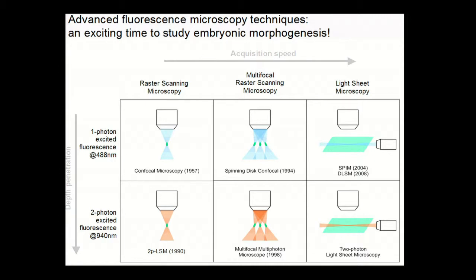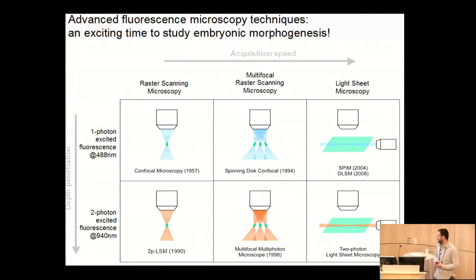The thing is that we can go deeper, faster, with lower phototoxicity using adapted microscopy techniques, and we generate a huge amount of multidimensional data. The challenge is to visualize this data, to process this data, and to visualize the features we are computing on this data. Working on this presentation, I realized that visualization is an issue for almost every aspect of my work, from the time we acquire the data to the time we publish the paper or communicate the work.